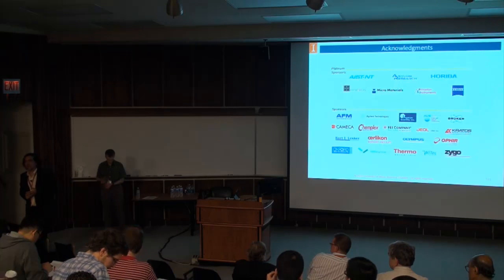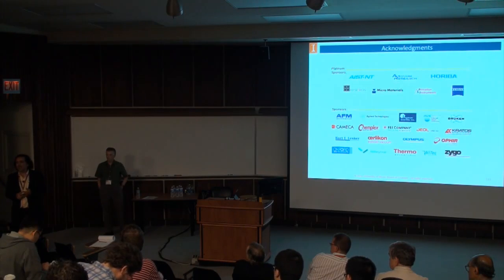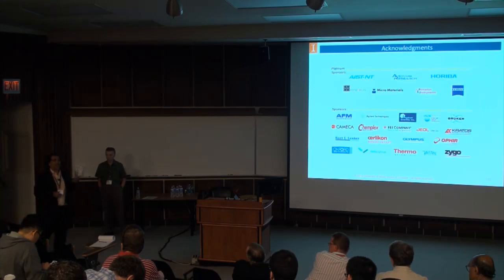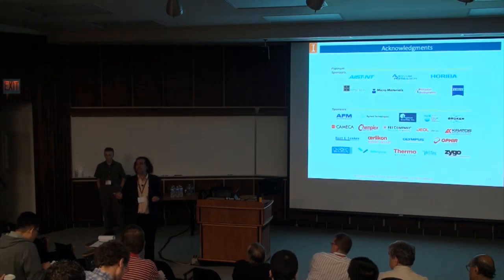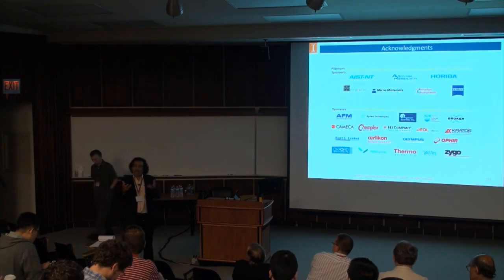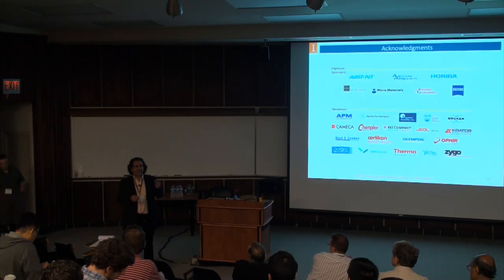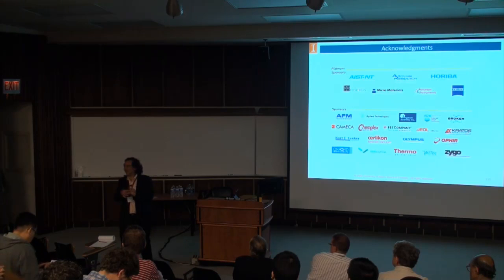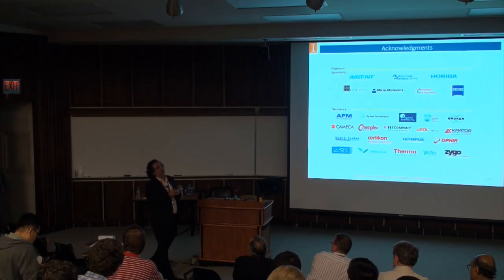Have a question? If you have a sample that you don't want to pulverize? Yes, very good question. Some samples you cannot actually make into powder. For example, we have had that. Some samples came from Krannert Museum, she came with little pellets. She said, you cannot destroy it. We didn't know what it was. You cannot destroy it. No sweat. So what we did, we put it in the X-ray machine.